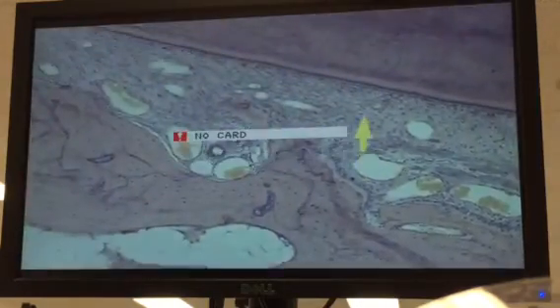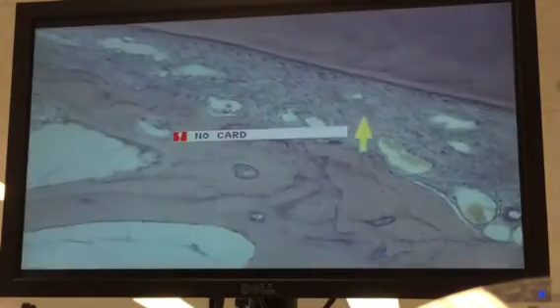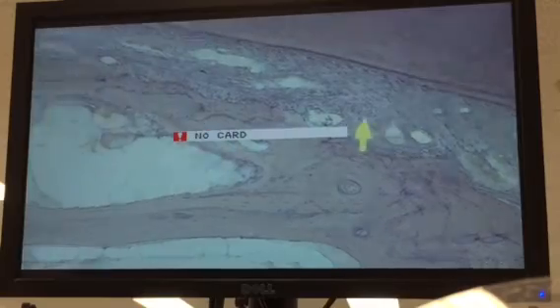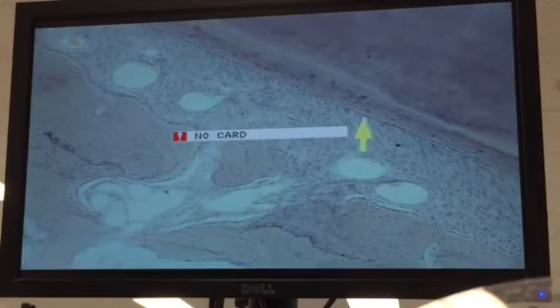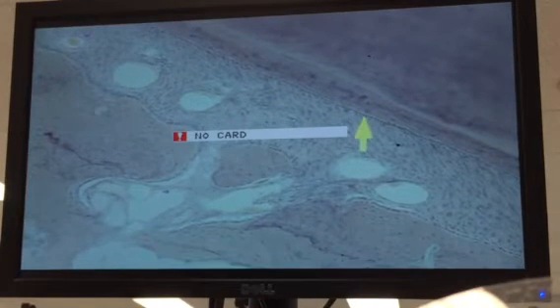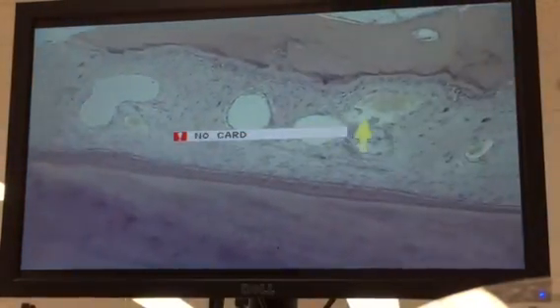And the fibers, well, we have nice oblique fibers right here. And this may not be the slide that I noticed a great deal of osteoblasts on, but we've got some cementoblasts right there. Let's take a look at the other side. Yeah, larger vessels.